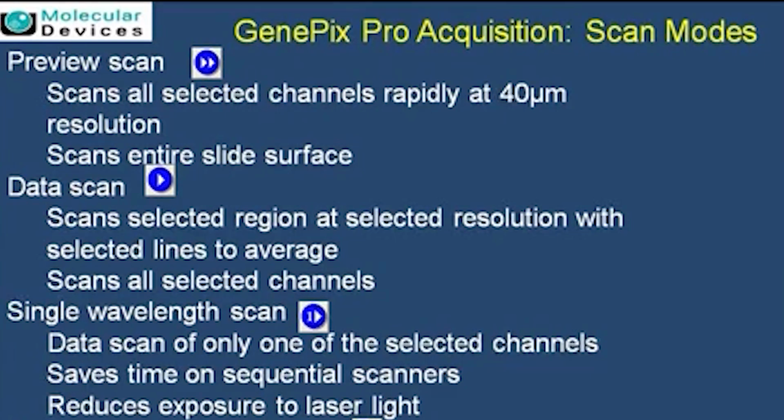So the basic one in the hardware control is, as we said, that we can look at auto PMT and other adjustments which are being done. For that we use preview scan. There are different tabs which allow you to go for the true scan and the preview scan, based on the laser and which particular scan you are using.